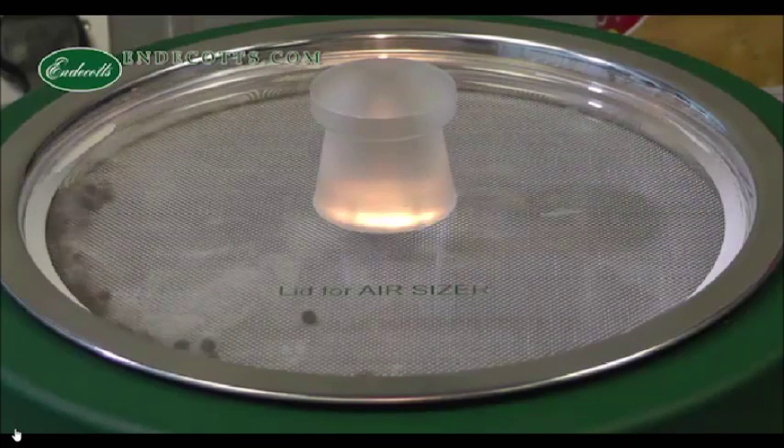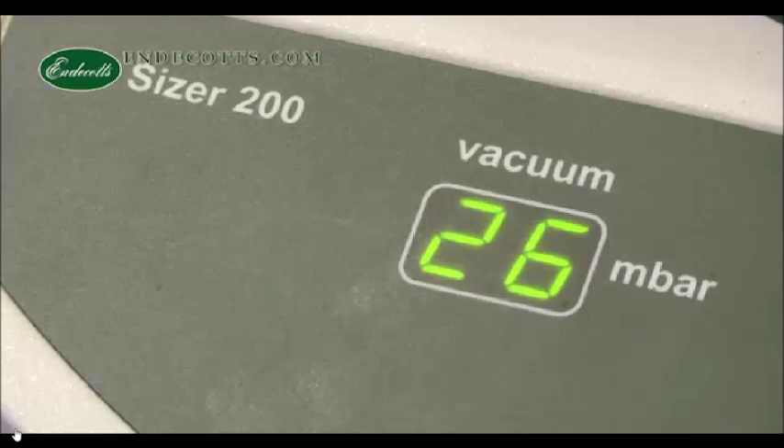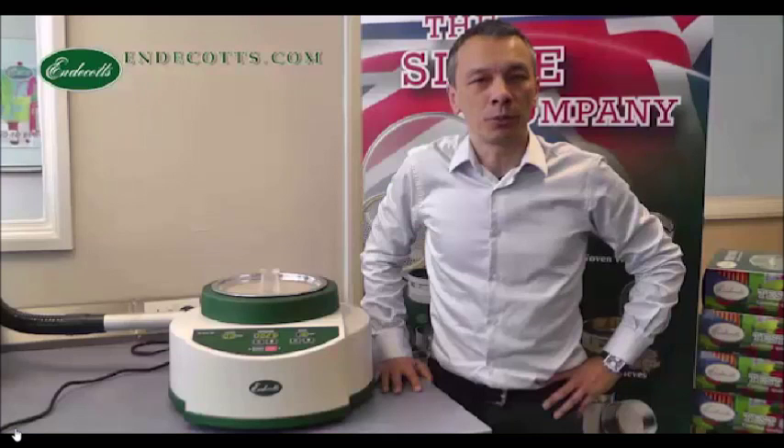You can see how suitable it would be for cohesive and very sticky material. You can see the pressure is illustrated in the middle bar, sieving time counts down, and the speed in RPM of the nozzle can also be adjusted. The AirSizer 200 is really one of the best machines for air jet sieving.